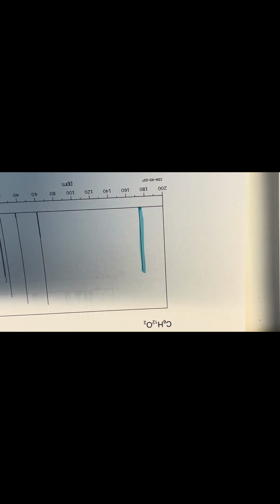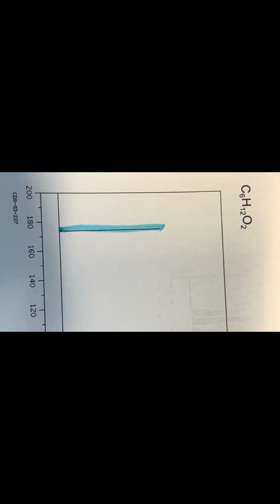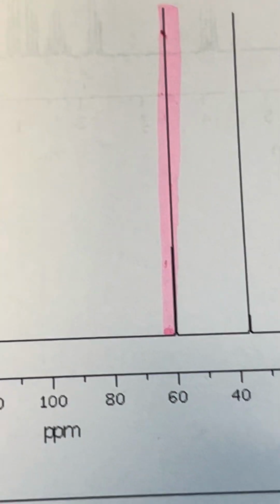So now I would like to consider this 13C NMR spectrum, and the first peak that we can focus on is highlighted. We could call that 172. This confirms a carbonyl carbon, which is typical of an ester again. So we're seeing that ester trend. There's also a peak at 60 that is notated.